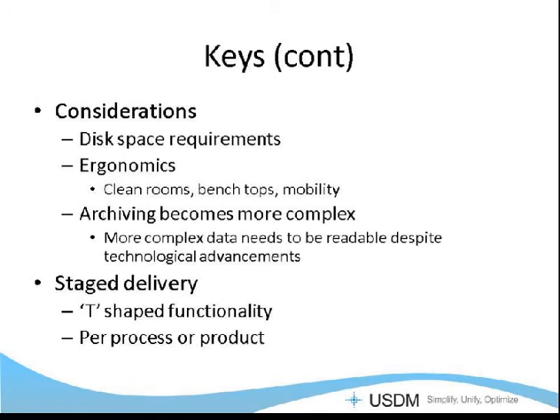Also, as I alluded to earlier, there's a lot of disk space requirements. You could have C of A attachments. You could have pictures, chemical models. There's a lot of variability in the type of data that you're now capturing. You could have some very large files, and the size can grow quickly, so you have to be able to anticipate growth and performance of the system.